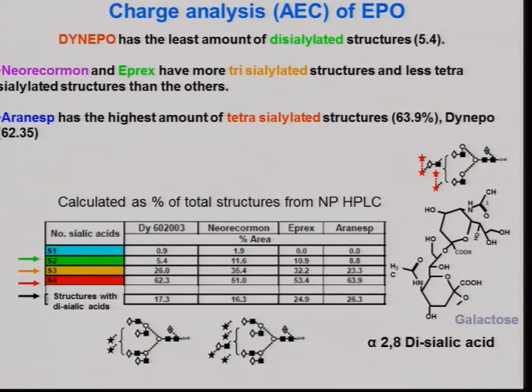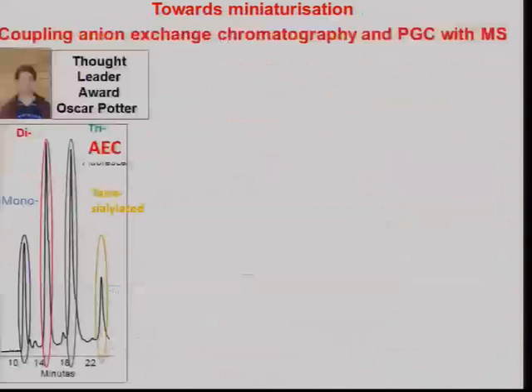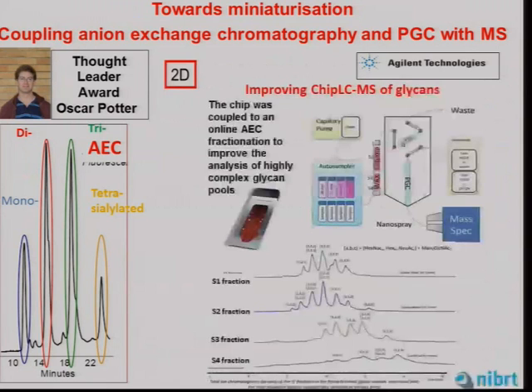Yeah, so you need to watch out for things that you might not be expecting. So it's why you need to do full analysis. But there are other technologies that are coming on stream. This is actually a chip from Agilent. So we had a thought leader when Oscar did this work.